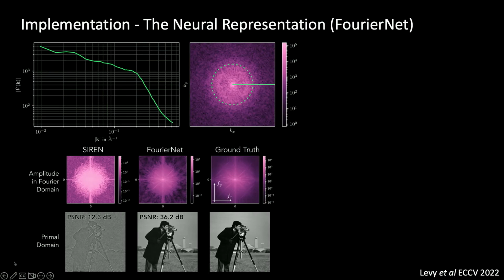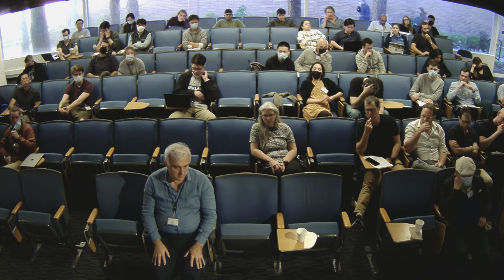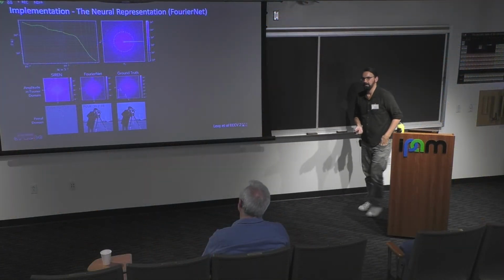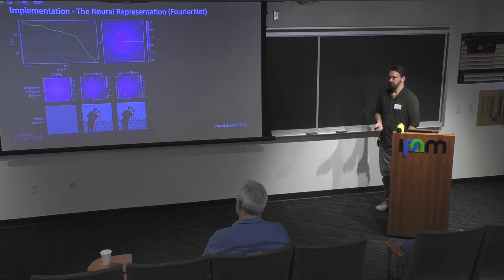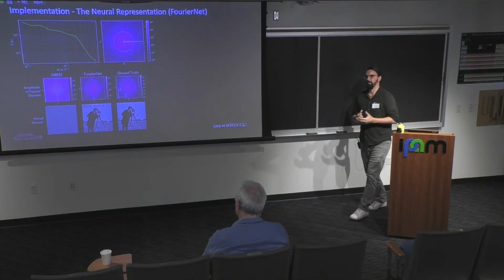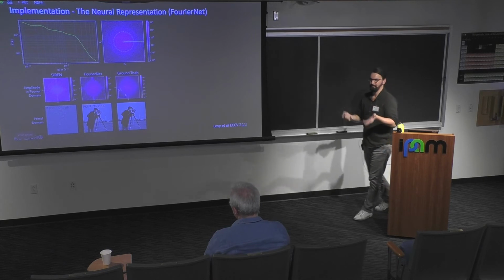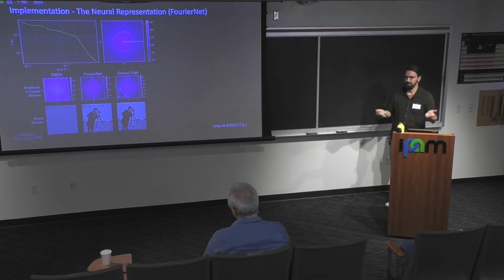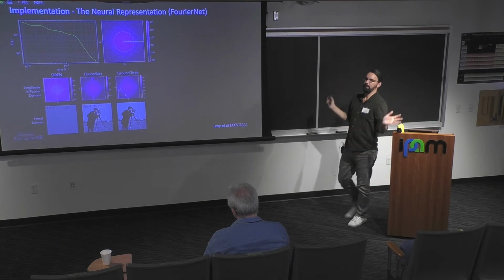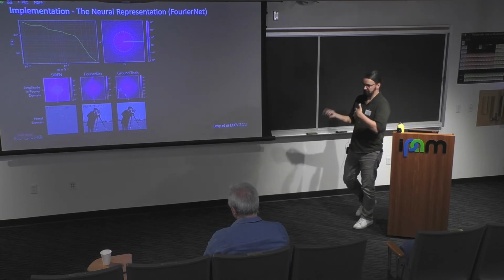In your loss, here we're seeing that the power spectrum falls off. So in your loss, is it white noise, like each Fourier frequency? Yes, we haven't really played with other types of noise models yet. I just wonder how it connects with this and the color. Right. So for example, in RELION and CryoSPARC, you would have a different variance at different frequencies for the noise. Here we have the same across. It's a sigma square. We actually don't even have it, because the way the loss is defined assumes white noise, the most boring white noise you can think of. Yes, that would be interesting to investigate, how that could impact the results indeed.